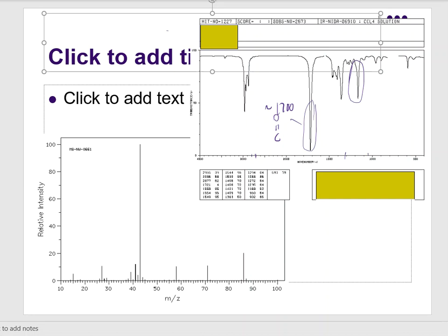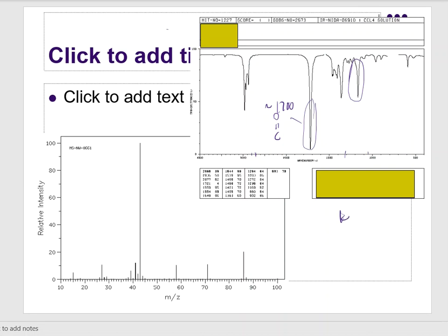And we've said in the past that if we had that combination, I would label it as an ester/ketone. The problem, though, is that this is very clear cut, so it really isn't even a problem. There is one major peak there, nothing else. For that reason, I'm going to make the determination that this is a ketone functional group, which means that there is a carbon on each side.